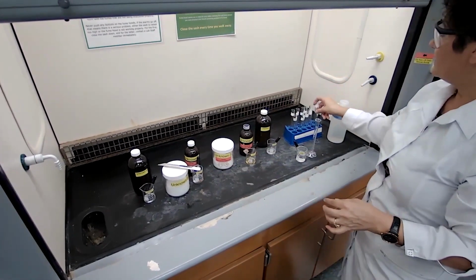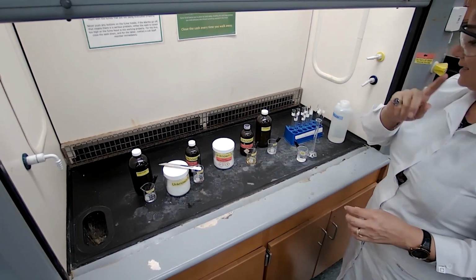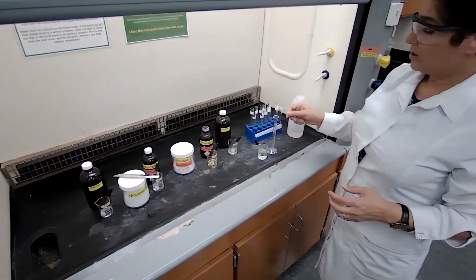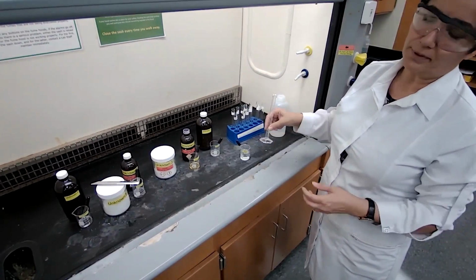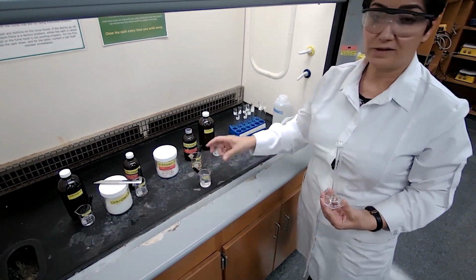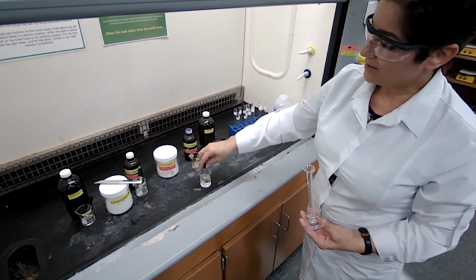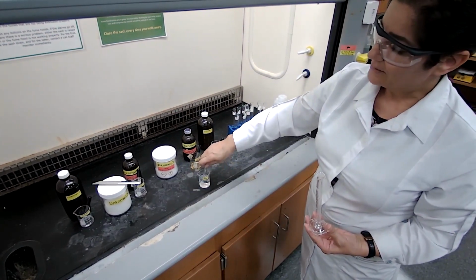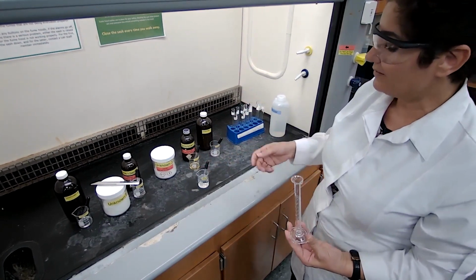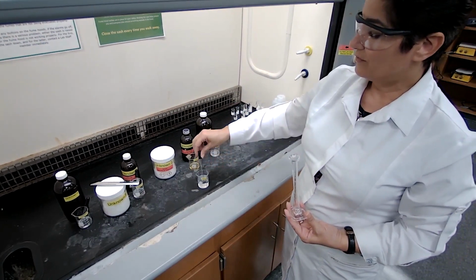Next, this approximation. In the manual, I even say 3 milliliters of water or 3 full droppers. I want to show you what I mean when I say 3 full droppers. This is going to save time, and I don't mind students' time being saved.